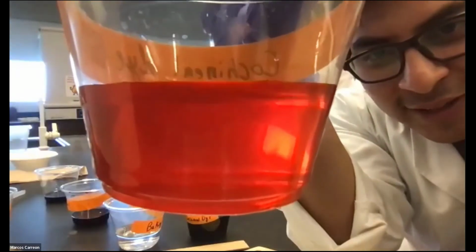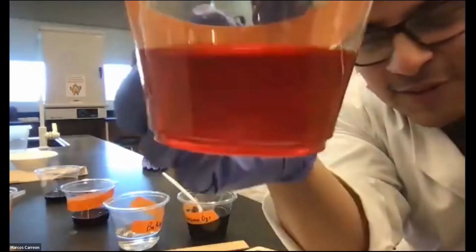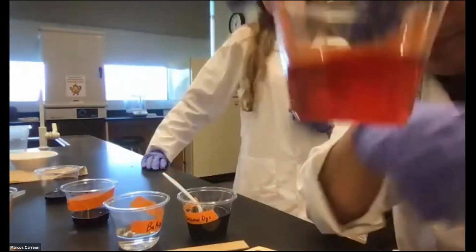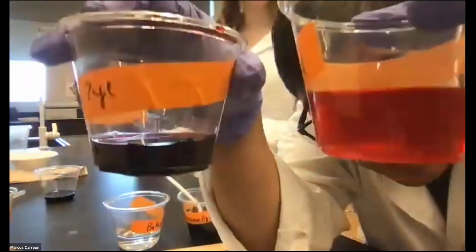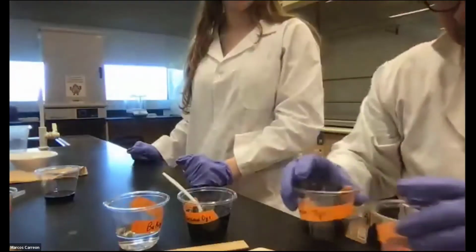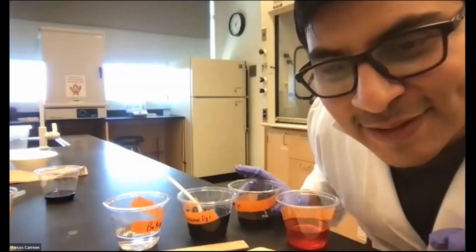So hopefully you guys caught that. So that's awesome. Look at that. So we can do this again if you guys want to see it again. We got enough cups. So this was the original dye solution, and it went from this color to this. So it's reddish, orangish. So we'll do that demonstration again for you guys. Hopefully you guys didn't miss it.